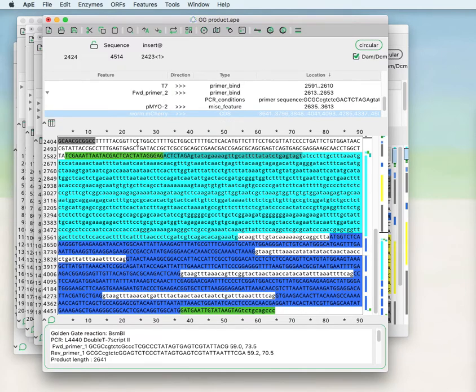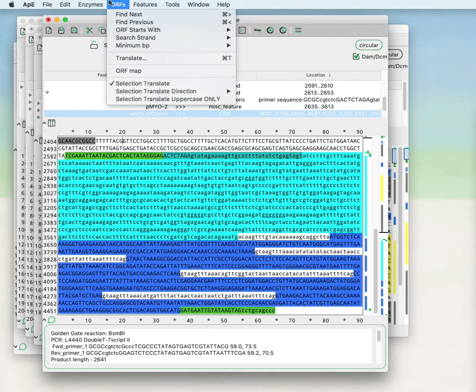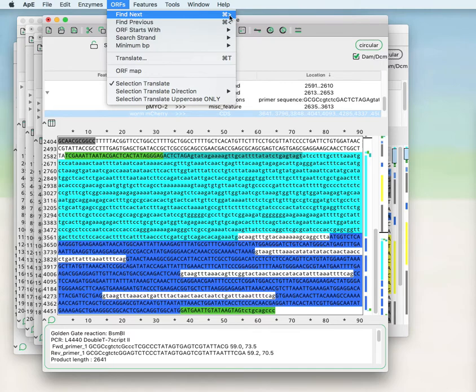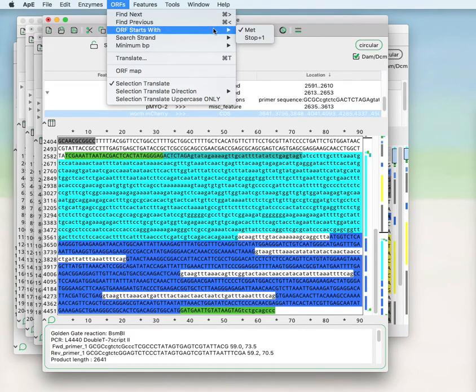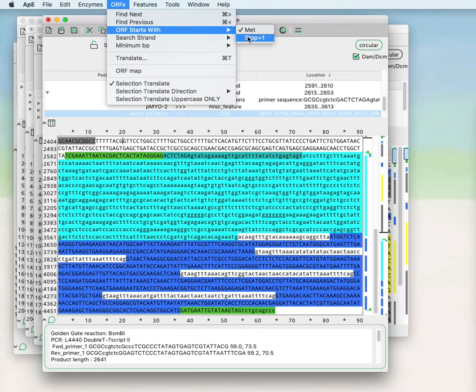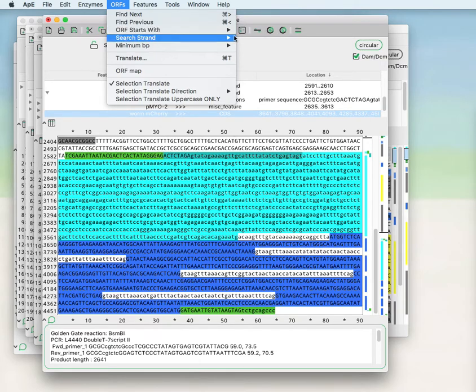If you would like to search within the sequence for open reading frames, you can do Find Next. That's also either control greater than symbol or command greater than symbol depending on whether you're on the PC or on the Mac. You can select whether that search will start looking with a methionine codon, an ATG, or whether it will start the first base after a stop codon.